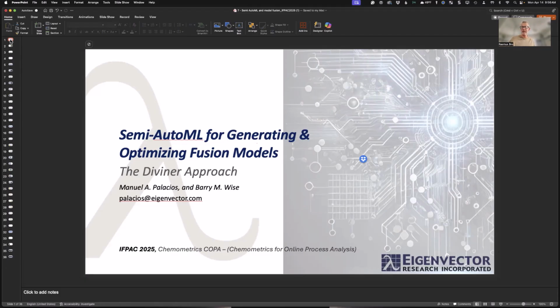Can I ask you, how does it work with the ensemble models in a regulated environment? How happy would they be about ensemble models? Well, that's a great question, because the same tools that you're using for a TensorFlow model, you're going to be able to use for ensemble models.